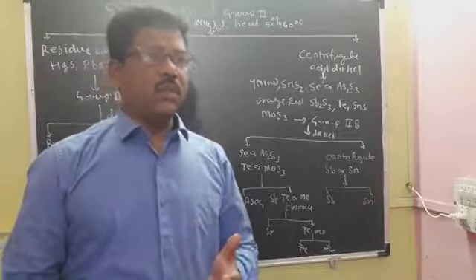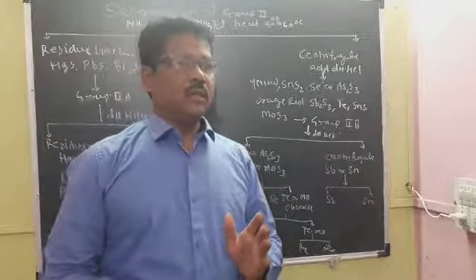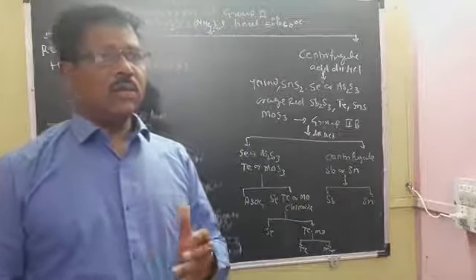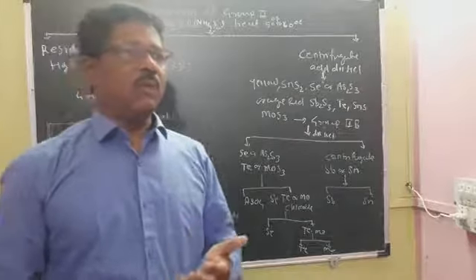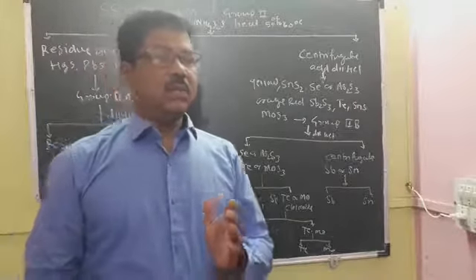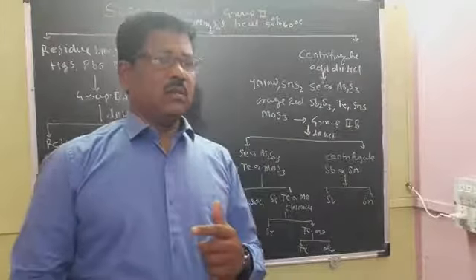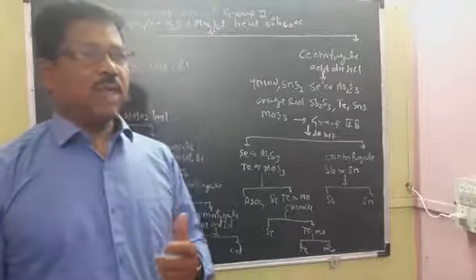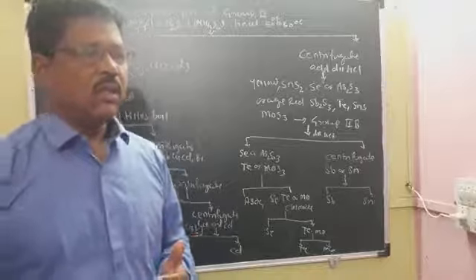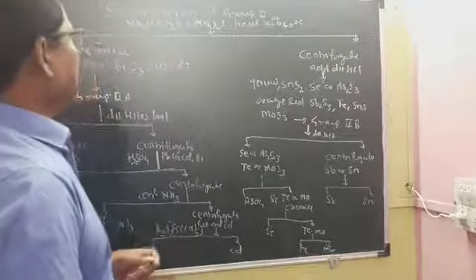Discard the centrifugate and transfer the residue into a small beaker, and then add 5 ml of yellow ammonium sulfide, that is, ammonium polysulfide solution, and heat to about 50 to 60 degrees Celsius, and maintain at this temperature for 5 minutes with stirring. If there is precipitate, cool and centrifuge. This is the separation of group second elements.